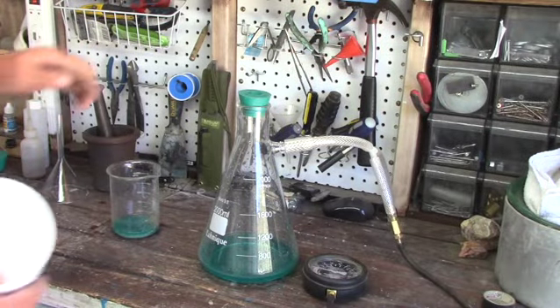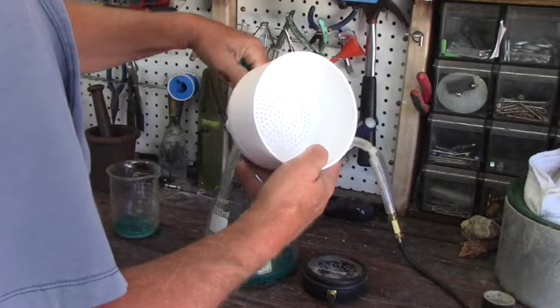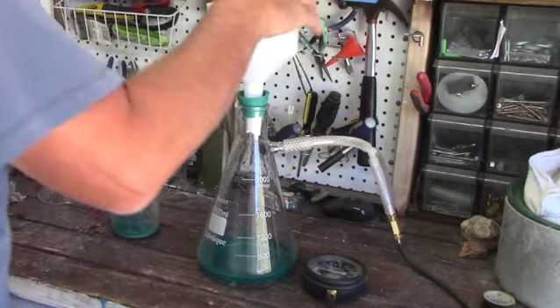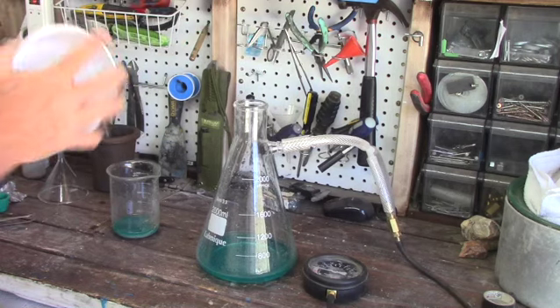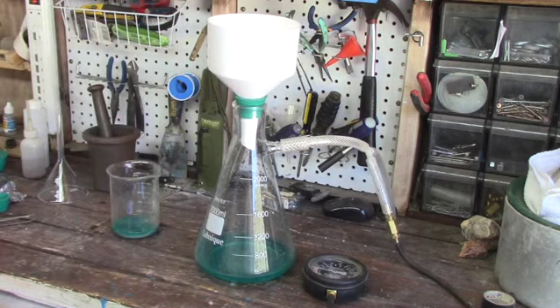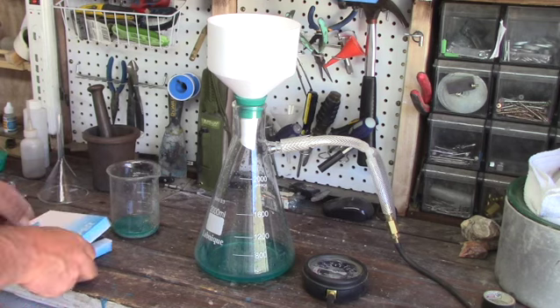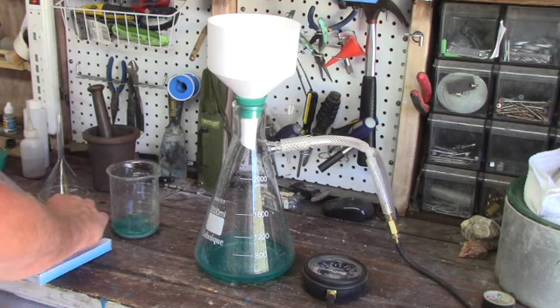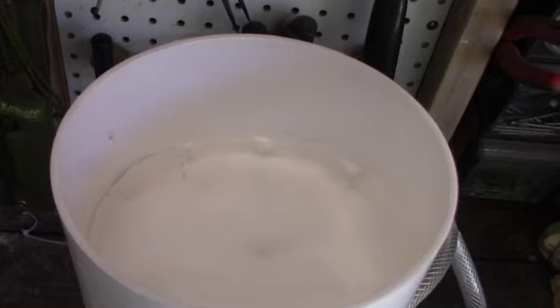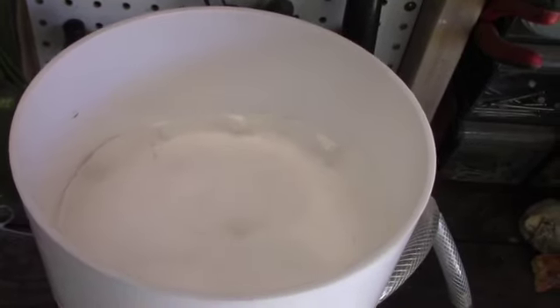We're going to use the proper funnel now — this is a Buchner funnel. It has a flat bottom, the filter papers sit flat in the bottom, and there's no way you're going to suck the filter through there unless you put too much vacuum on it. This is the funnel that you want to use if you're using a vacuum flask.